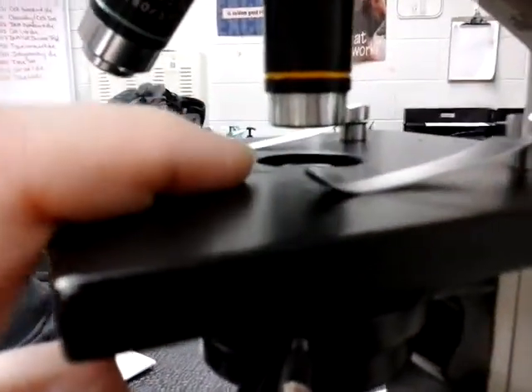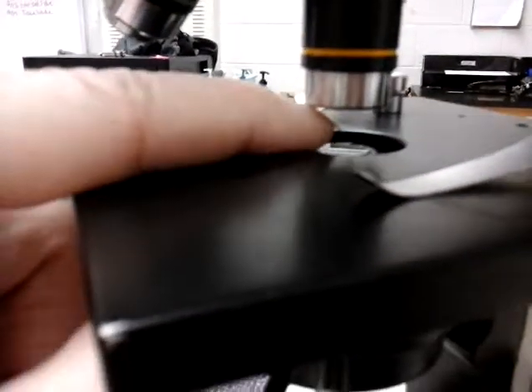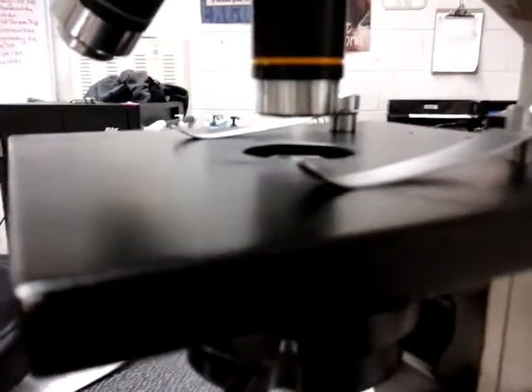And so right now you're like, but there's still a lot of space between there. Well, there's nothing here right now. But remember, you're going to have a slide there, which is a piece of glass. And so that glass is going to take up that space. And you can crack that glass and you can crack that slide.